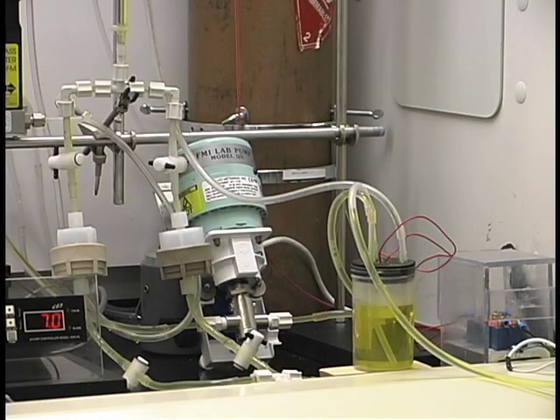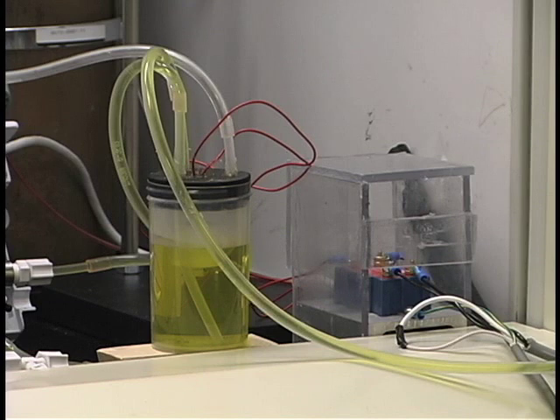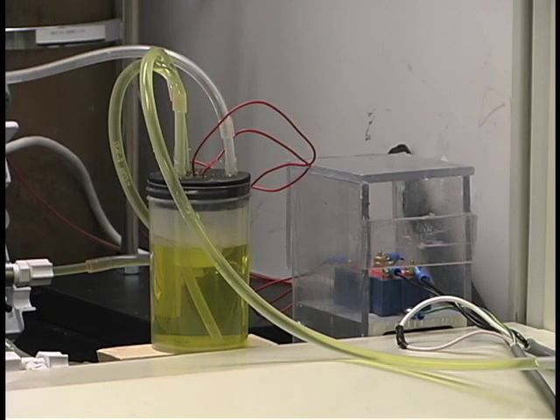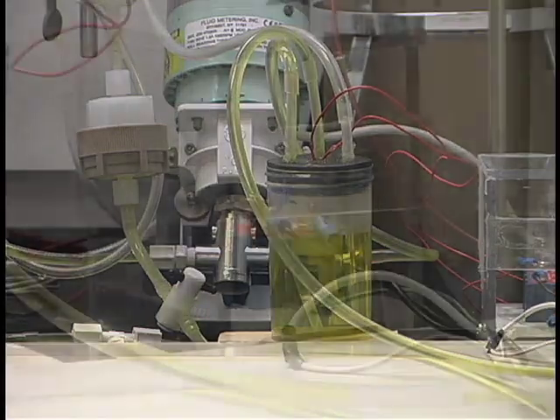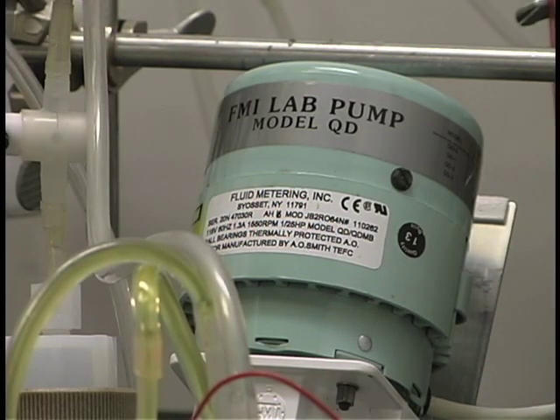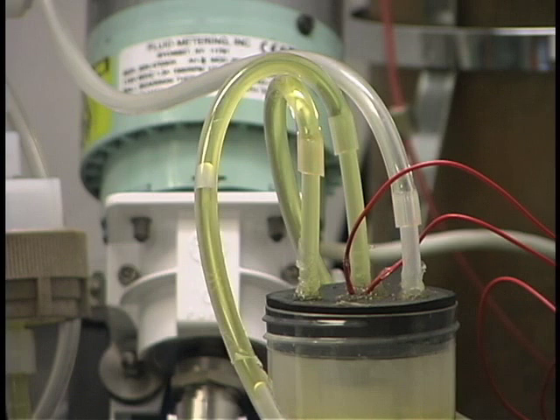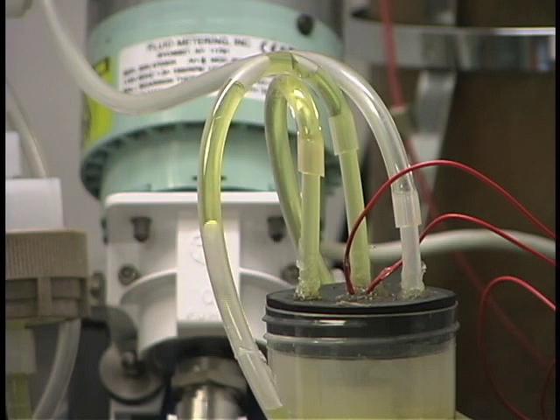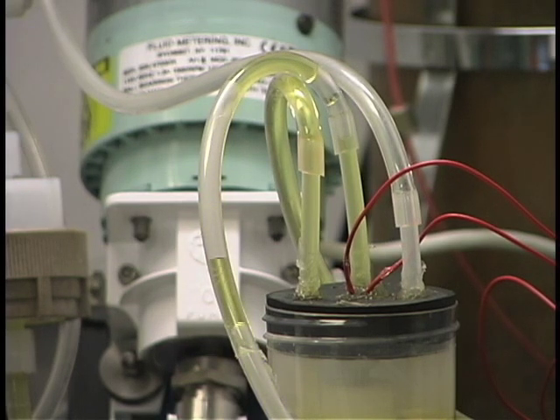It was difficult to operate the gas collection apparatus straight out from the headspace of the photoreactor, so we installed a small gas separation vessel just downstream from the photoreactor. In order to be able to measure the gas evolution volumetrically, it was necessary to maintain a constant headspace inside the separator. To perform this function, a fluid level gauge was connected via a relay to a small pump. In this view, the photoreactor input, output to the scrubber, gauge wiring, and ancillary circulating pump can be seen.